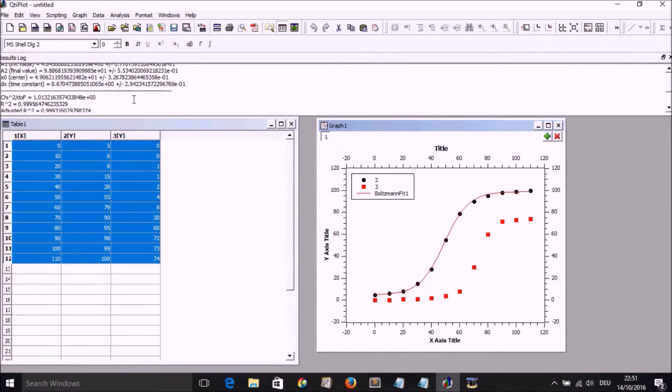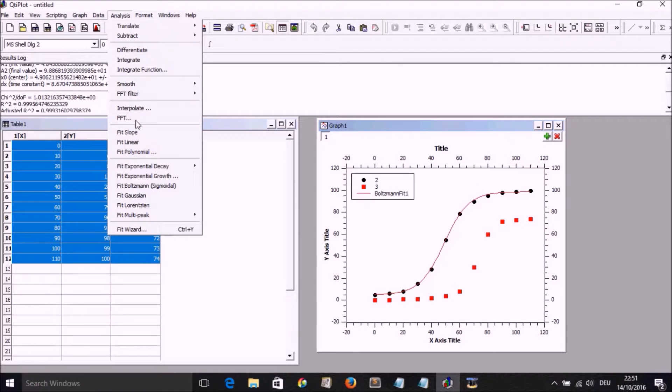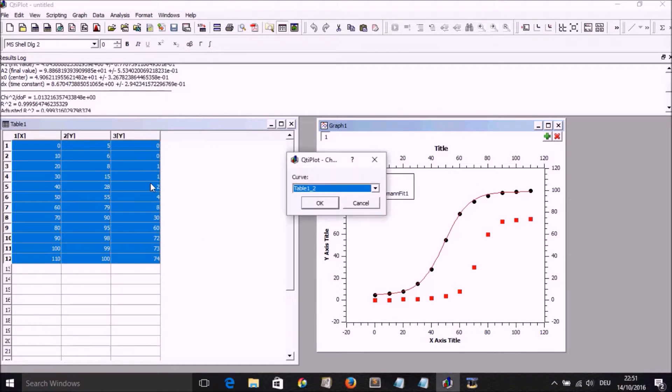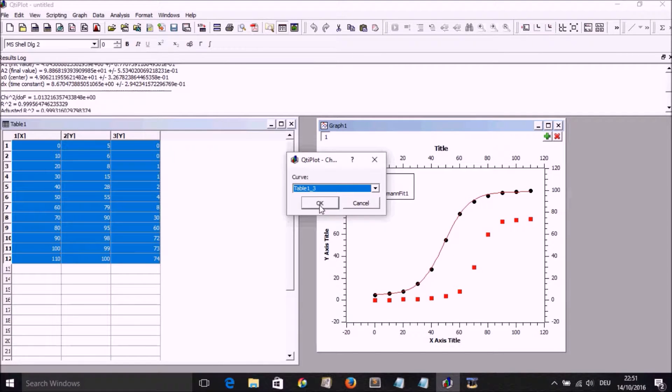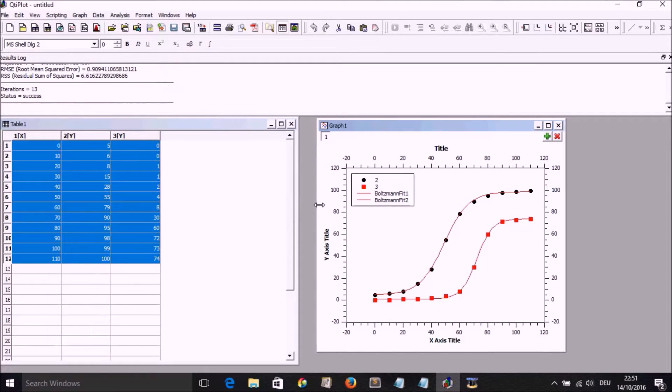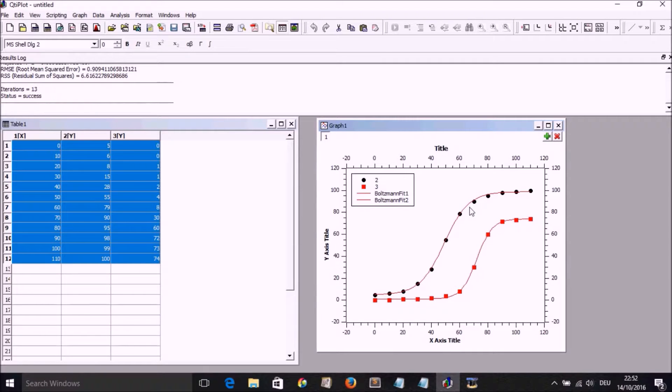So we could go again to analyze, fit Boltzmann, select the second curve, and we are going to have this fit along the points.